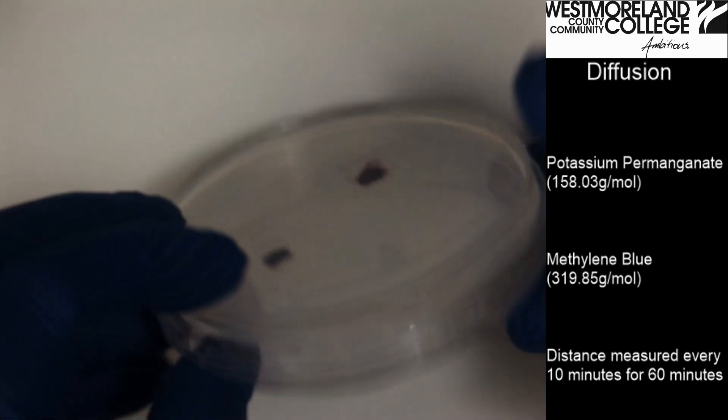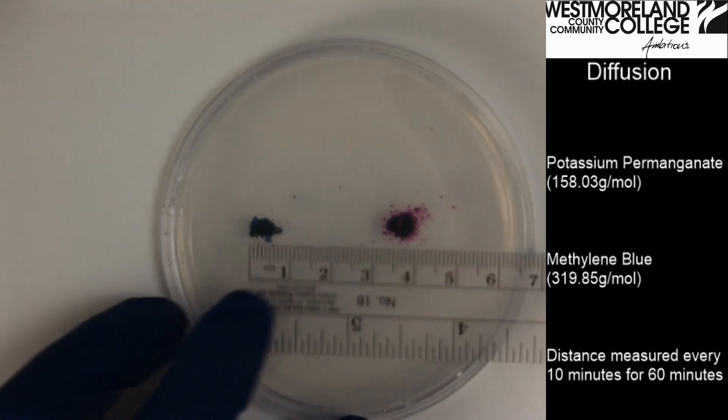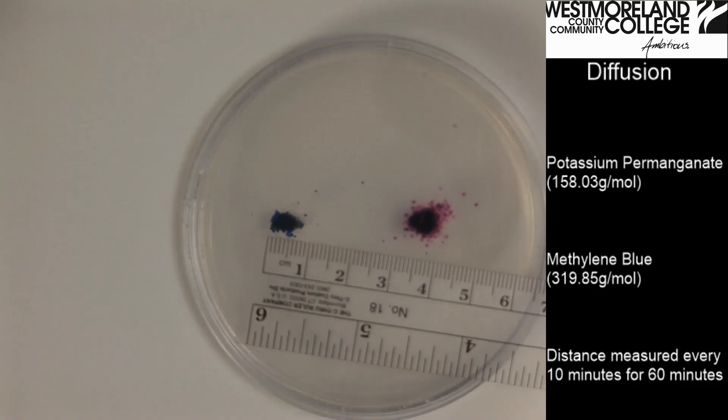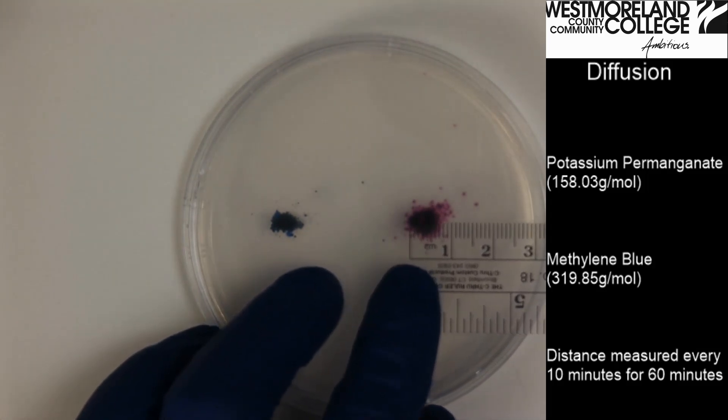Now I can flip my plate over and measure the initial starting size. The methylene blue appears to be eight millimeters, and the potassium permanganate appears to be about seven millimeters.